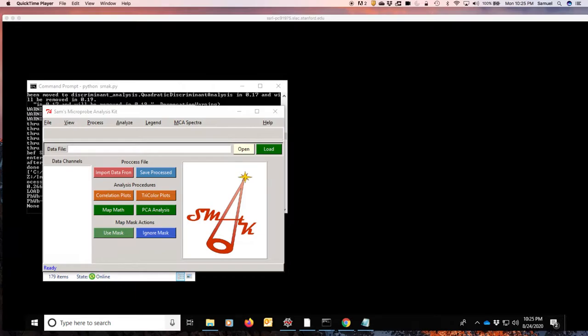In here we will show you how we treat this data at SSRL and how we can process it to get some color information. I will show you a few examples of different things you can do with that particular dataset.